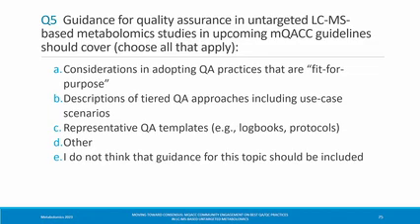So anyone that has gone through a QA, ISO 17025 knows that it's fit for purpose. So you say what you're gonna do and you're audited against what you say you're gonna do. So I don't think we can apply a QA system and just choose things not to use. So we do need to follow the whole tier of the QA system and just say the limitation.